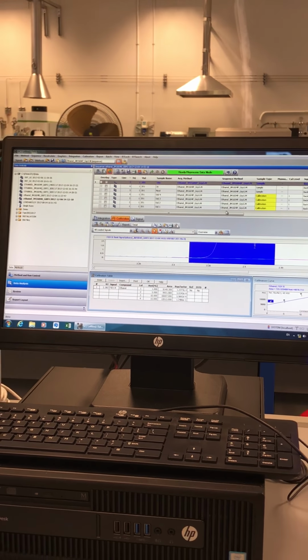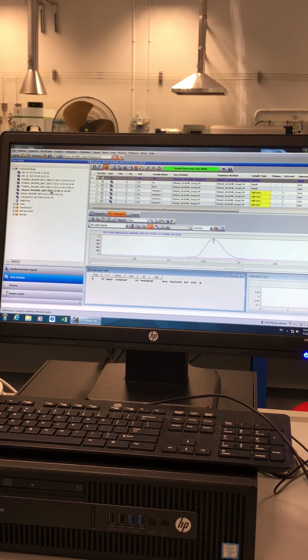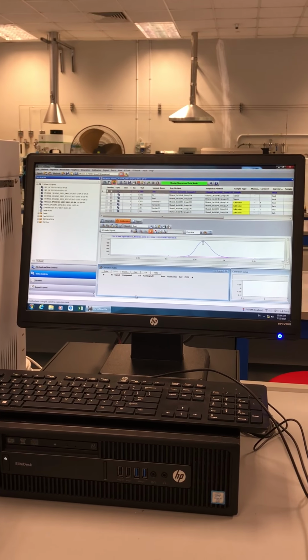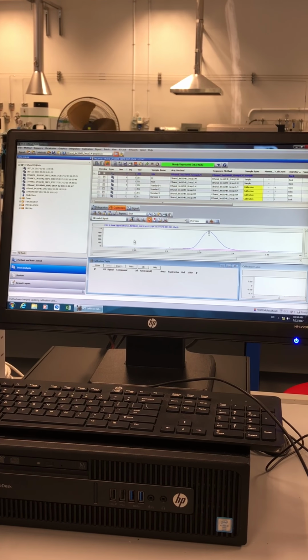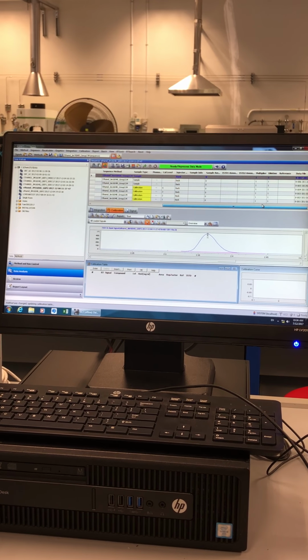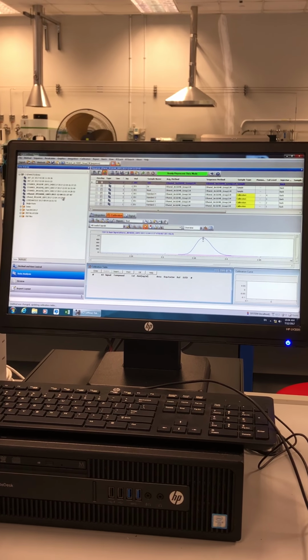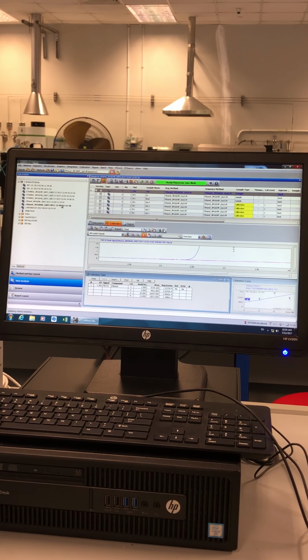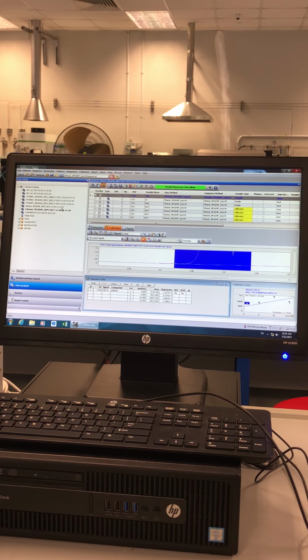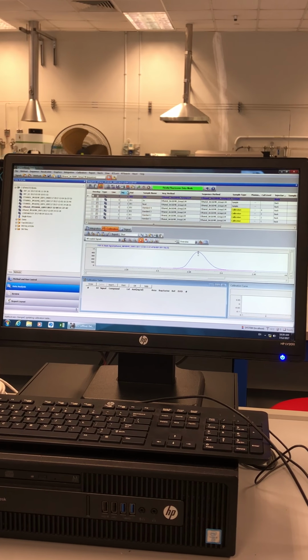Once you double click on your named folder, you should see a pop-up table on the right top hand corner. There's a nice table there. You should have 7 samples, so 7 rows basically. You have 7 rows, right? Oh, you don't have?